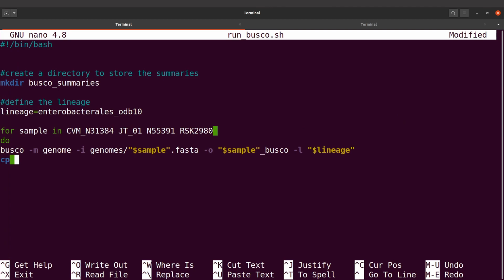So I'll say cp $sample_BUSCO/short_summary.*.